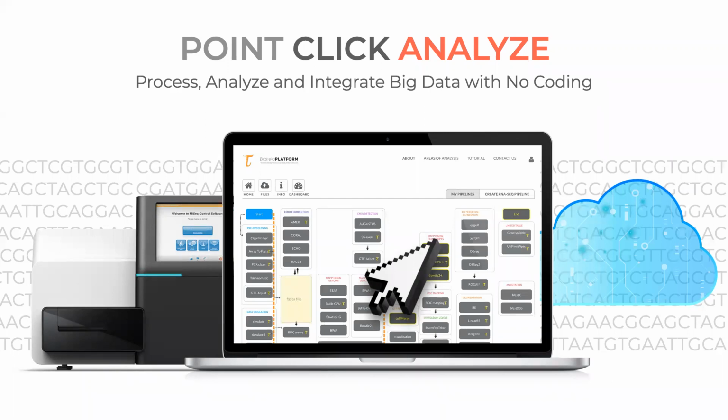For those of you that are already familiar with bioinformatics pipelines, we will actually take a look at some of the settings and the options that allow us to study the data and extract different types of outputs from this data. We will also then later on go into the specific code that allows us to run these different steps and see what kind of variation we can work with using coding.